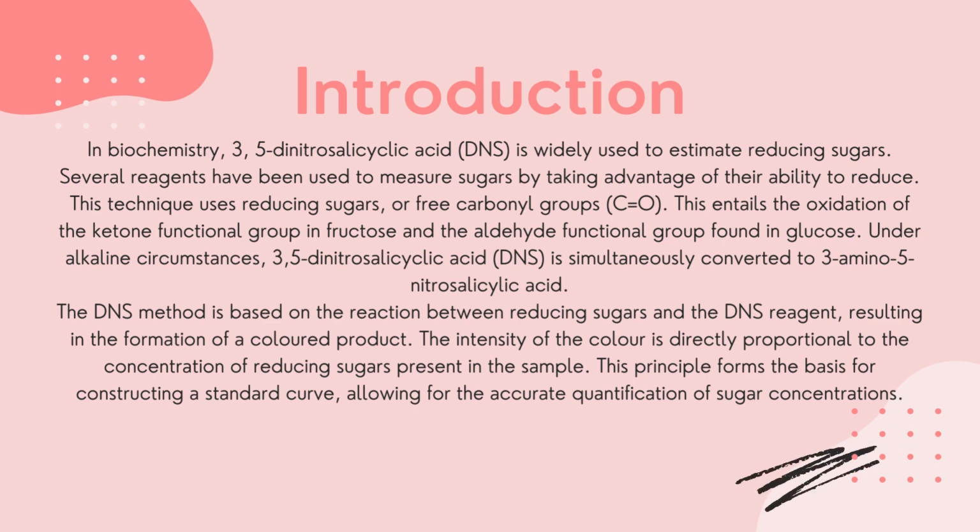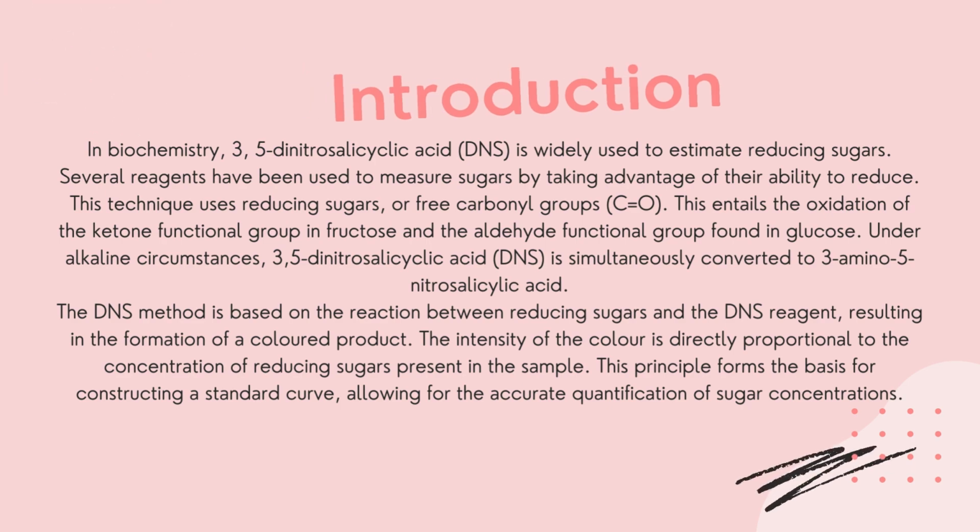Under alkaline circumstances, 3,5-dinitrosalicylic acid (DNS) is simultaneously converted to 3-amino-5-nitrosalicylic acid. The DNS method is based on the reaction between reducing sugars and the DNS reagent, resulting in the formation of a colored product. The intensity of the color is directly proportional to the concentration of reducing sugars present in the sample. This principle forms the basis of constructing a standard curve, allowing for the accurate quantification of sugar concentrations.